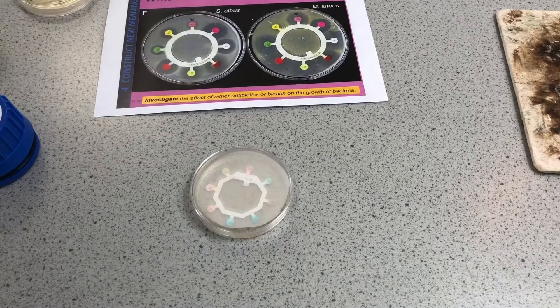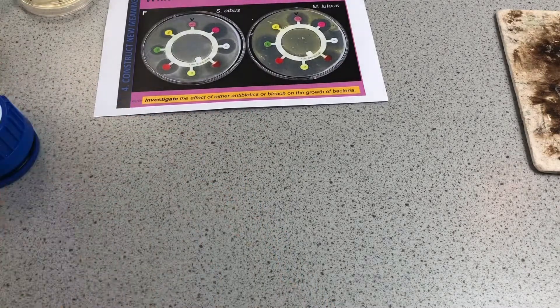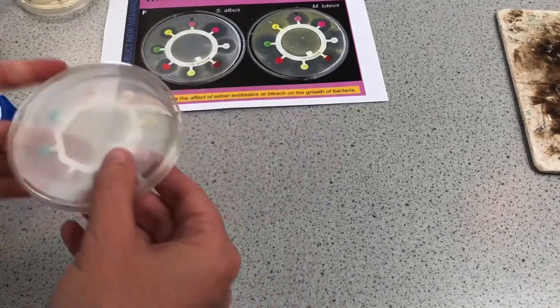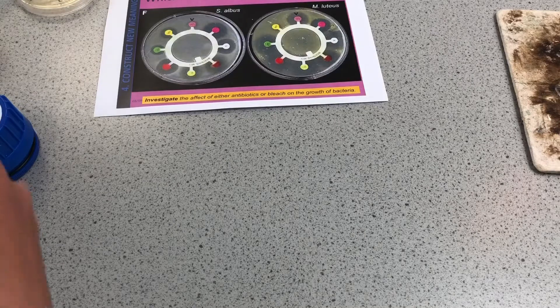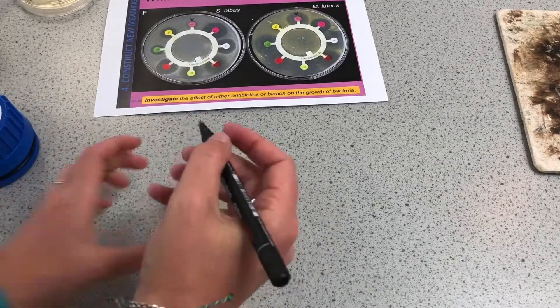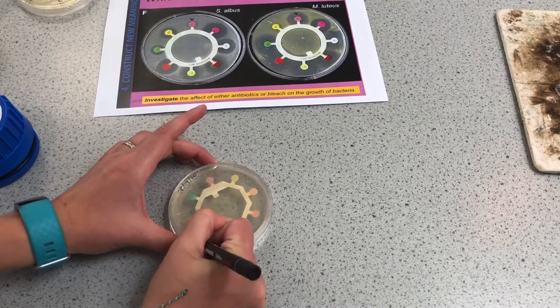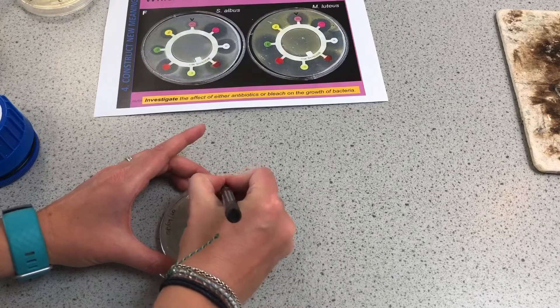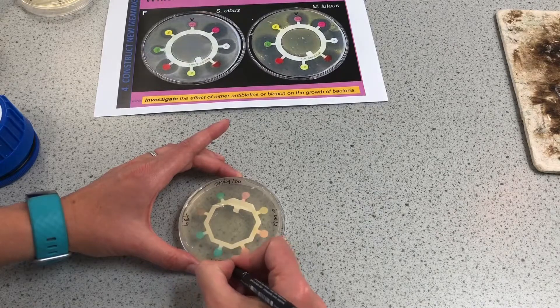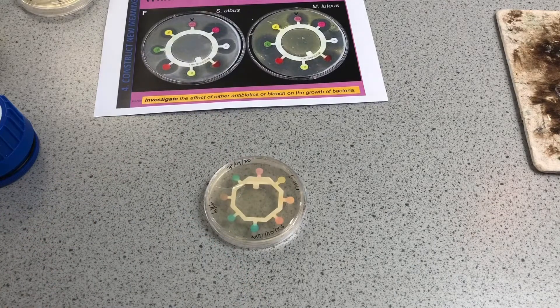I'm going to do exactly the same with my tape, creating aerobic conditions by allowing oxygen in. We've got some condensation forming there already, so we're going to store that upside down. What's good about using a permanent pen is that even though I've taped it, I can write over the top. I'll write my name and the date, and we've got E.coli and antibiotics.